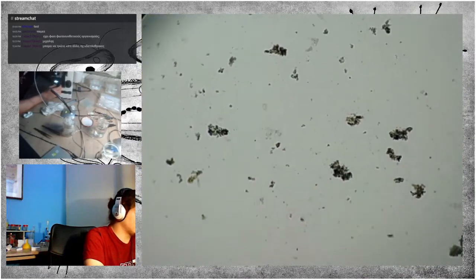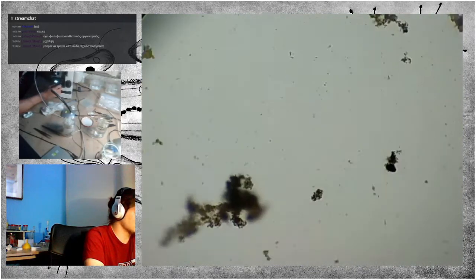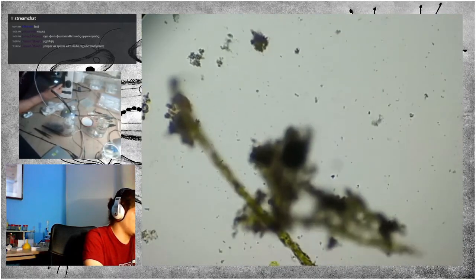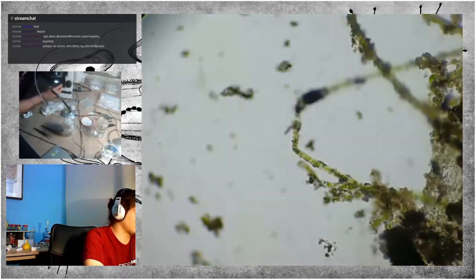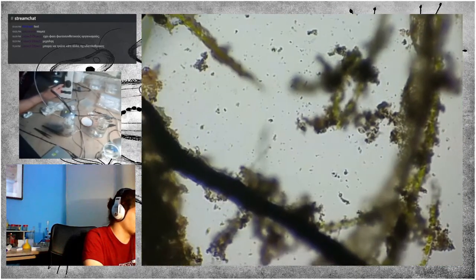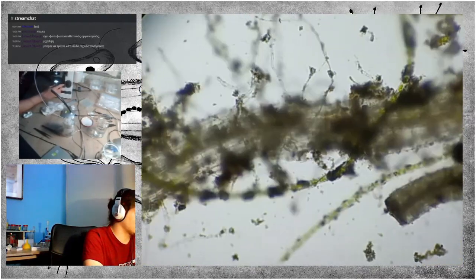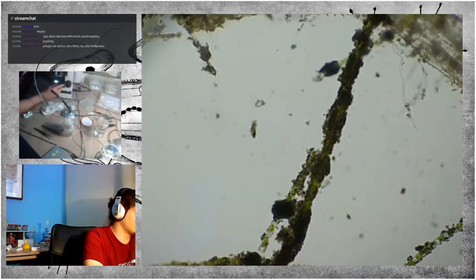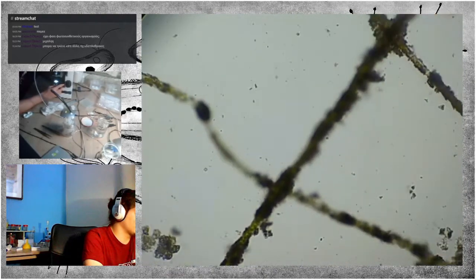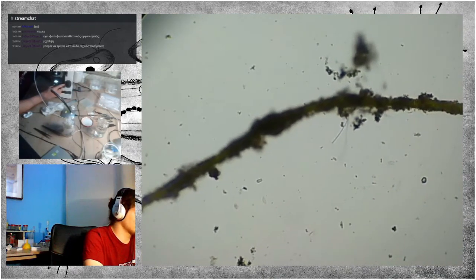There is quite a high possibility that in a few days there will be stuff, because there are cysts around that you cannot identify unless they get out of cyst mode. Or maybe there are small versions of larvae essentially, or the equivalent of larvae for the microorganisms.